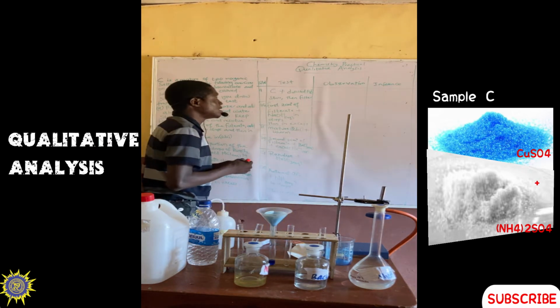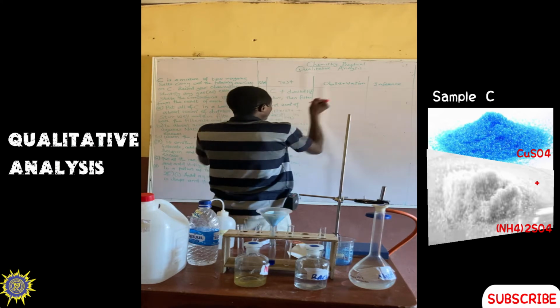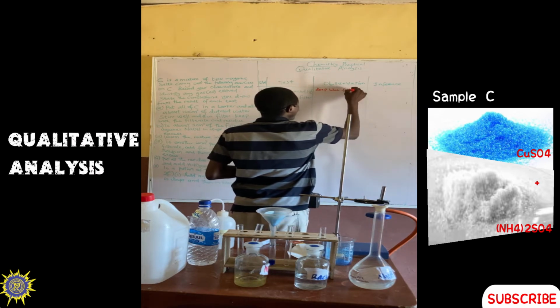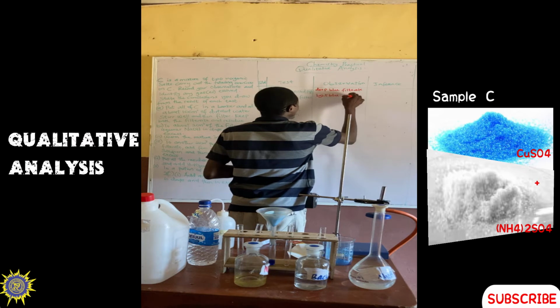So we can see that when we add water to this, we have deep blue filtrate, then light blue residue. What does it mean?